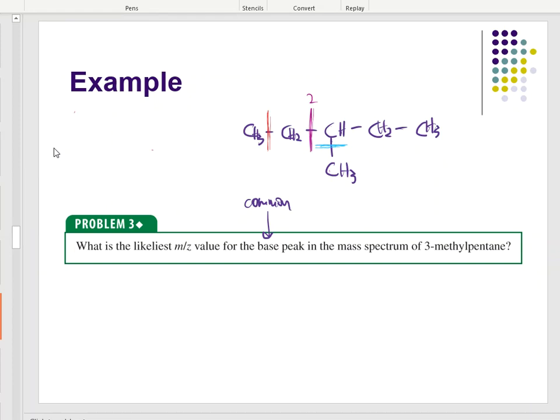I'll get 1 carbon, and then the 5 carbons that are left over. Not necessarily the same as in red, though. And the reason is because this is a 1 carbon, yes, but this was not a straight chain 5-carbon piece. This was a 4-carbon piece with a carbon hanging off the side. So that is a different type of fragment there.